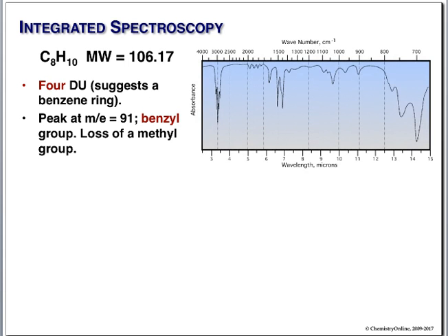Our infrared. The way I like to do infrared, and you probably know this, is to start at the top and just work our way down. 3400, do we have an OH peak? Nope, we know what an OH looks like. It's big, it's fat, it's broad.